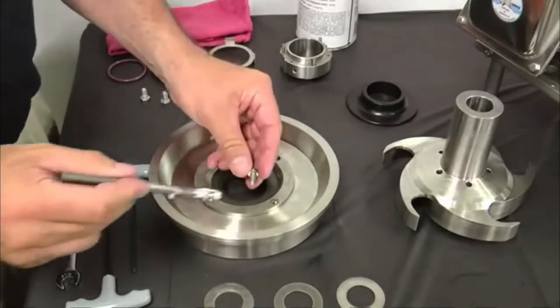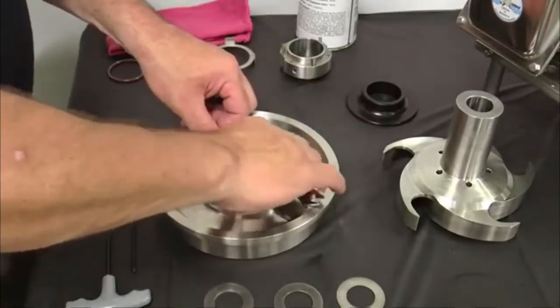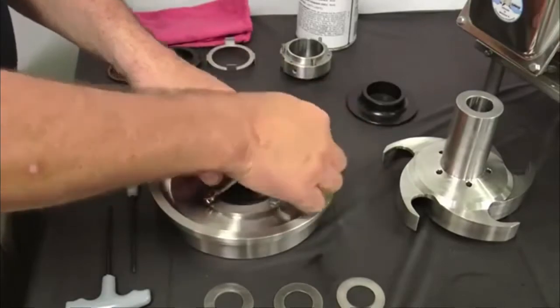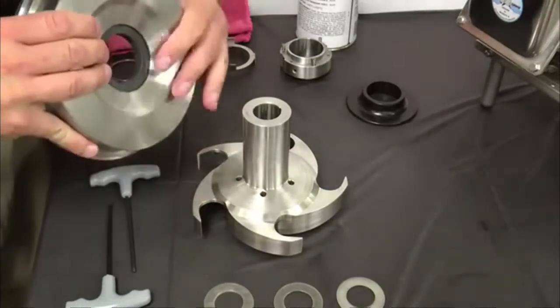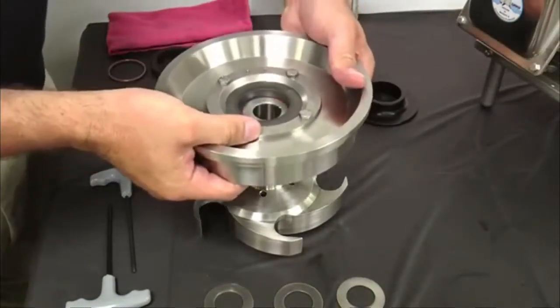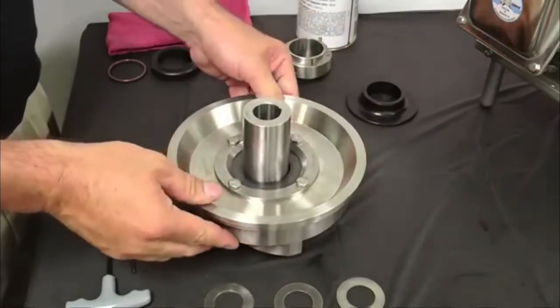Apply anti-seize compound to the threads and secure the retainer with four quarter-20 by half inch hex head cap screws and tighten evenly. Place the impeller on a clean flat surface shaft end up and slide the assembled back plate onto the impeller shaft. Avoid hitting the stationary seal against the impeller shaft as it could break the seal.